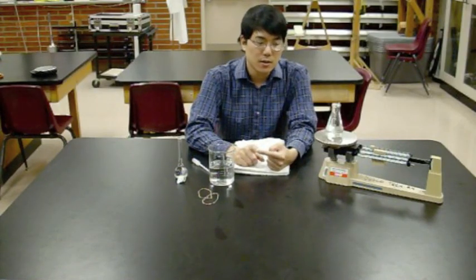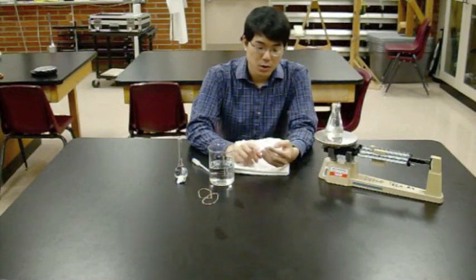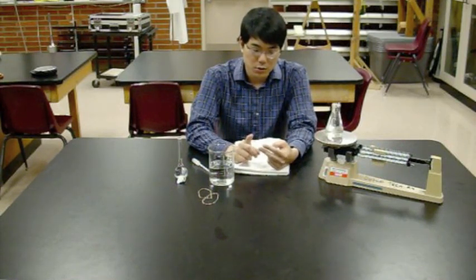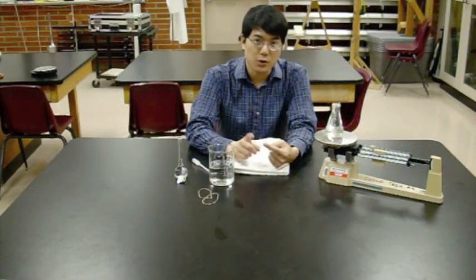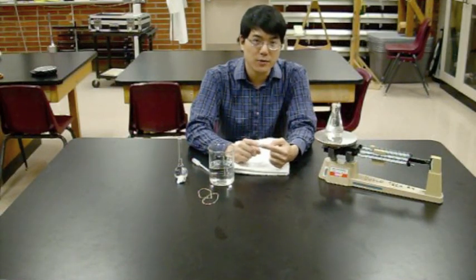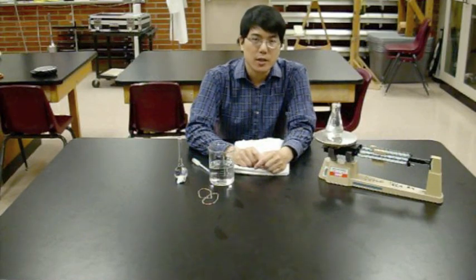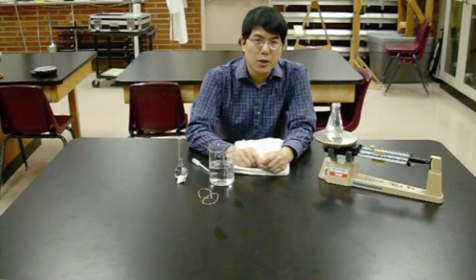The one additional measurement you took during part one was the mass of the vapor once it condensed back down to a liquid. So you can use pressure, volume, and temperature to calculate the moles of gas. You know the mass of that same quantity of gas. Pretty easy from there to calculate molar mass. And that's what you need to do in your analysis section along with one or two other tasks.